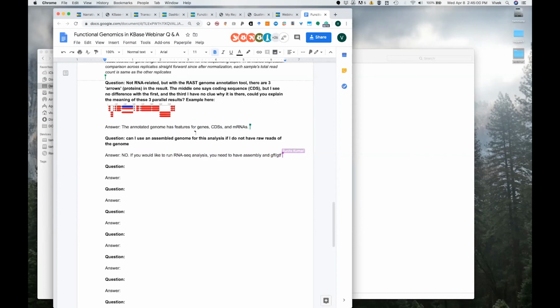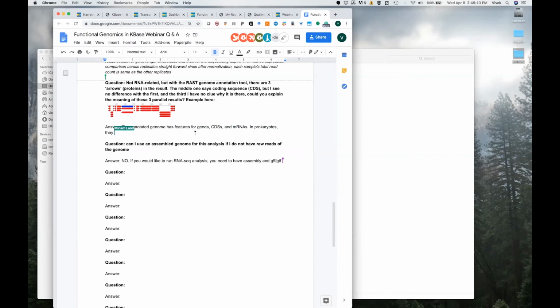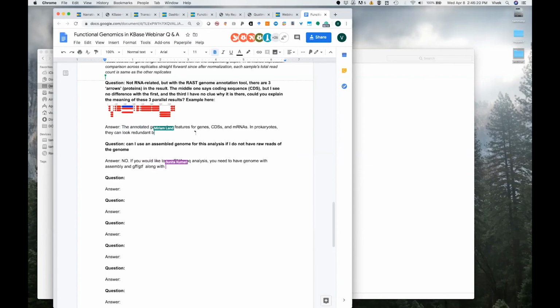Then you can map against that transcriptome using Bowtie, which is an ungapped mapper. In that case, you don't want to use TopHat, HISAT, or STAR; you want to use Bowtie to map your raw reads against a de novo transcriptome. But we do not support that in KBase. Just for the context of this question, I provided all those different scenarios of what you can theoretically do.